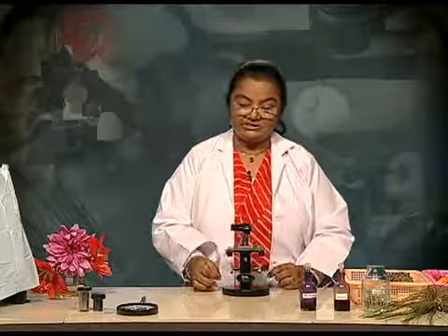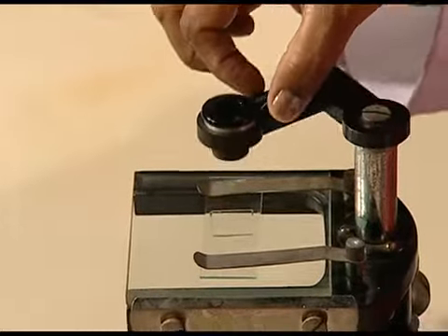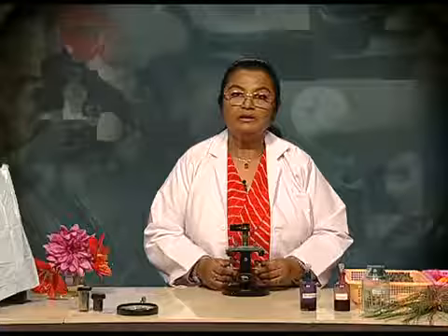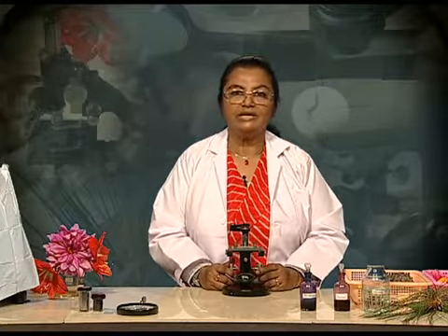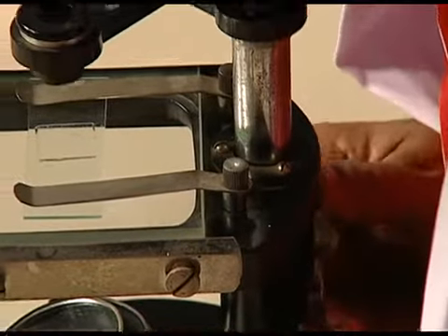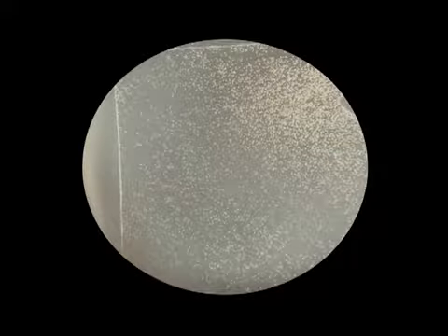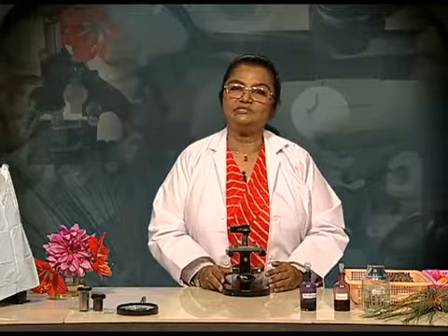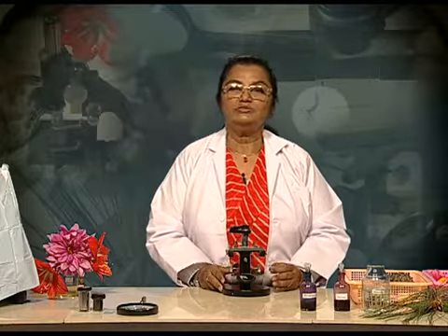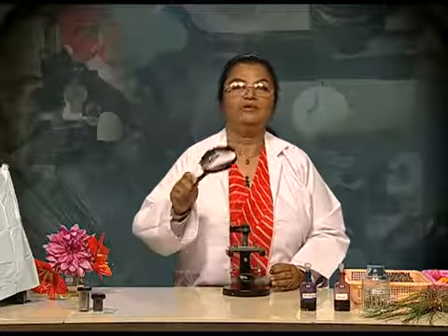We can further adjust the lens over the object with the folding arm. Now we will rotate the adjustment knob to bring the object to clear focus. Through the dissection microscope, we can see the pollen grains are appearing much bigger and they have a certain shape which is much different from the small specks of dust that we saw with the help of hand lens.